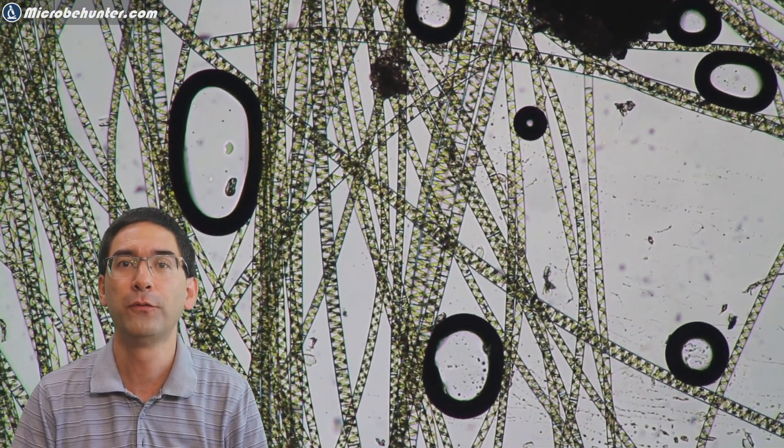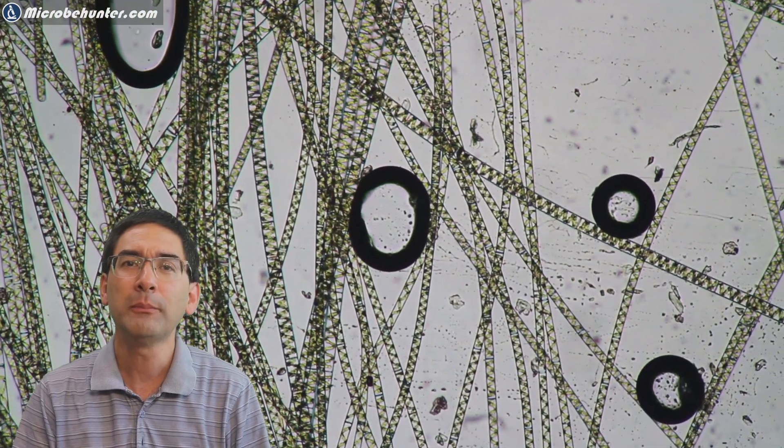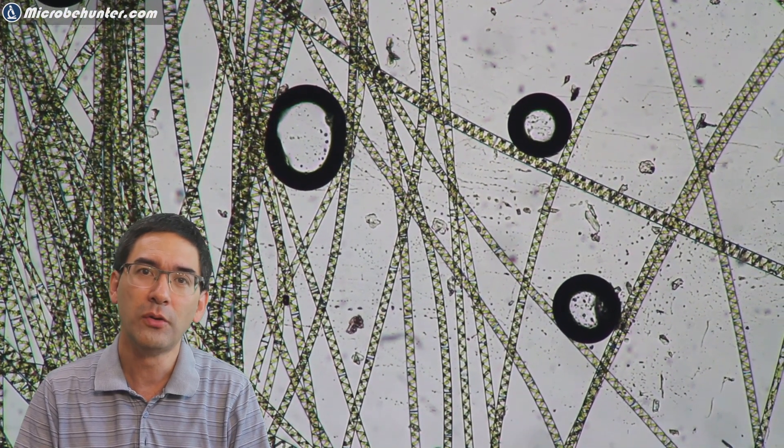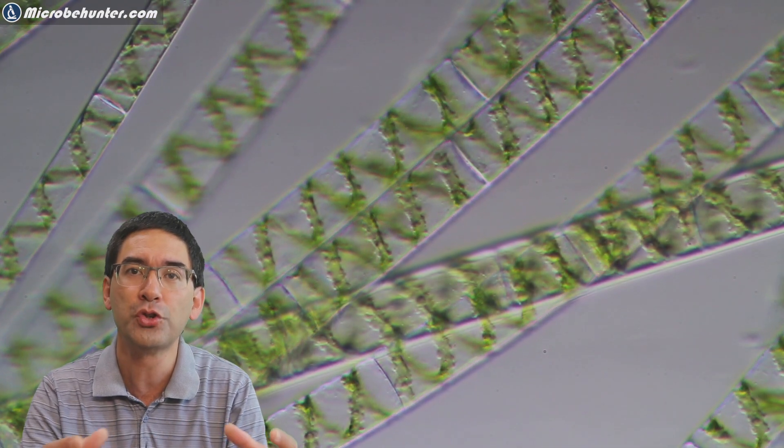So this is using a four times objective, you can already see that there's some of these bubbles there and I decided okay what I'm going to do is I'm going to do a time lapse and so for a very long time I recorded the development of these oxygen bubbles.